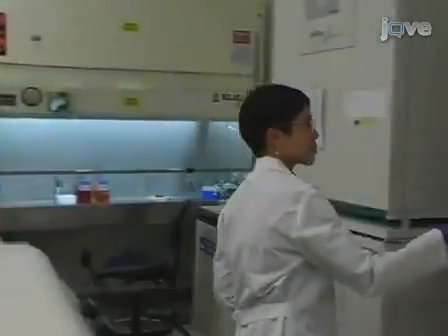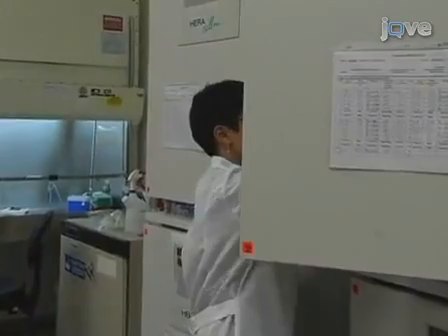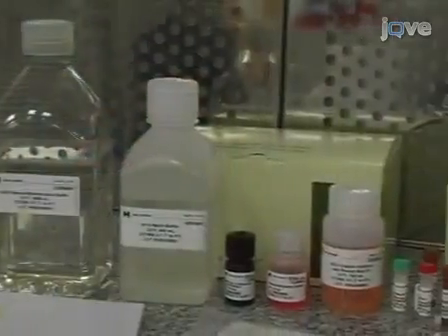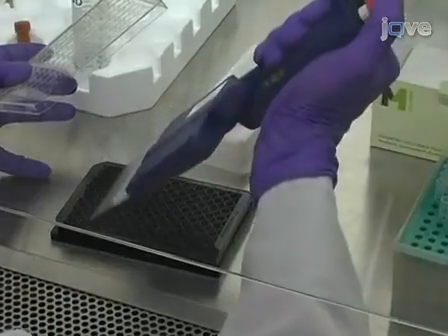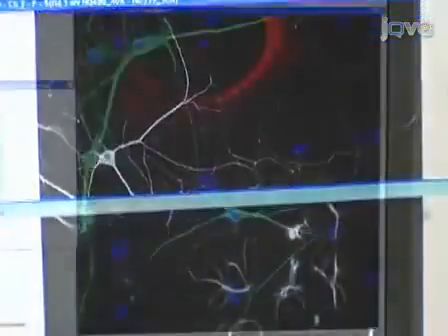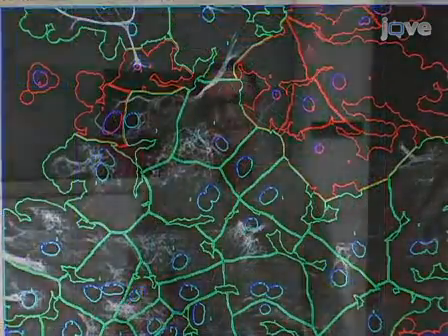Hi, I'm Andrew Ball, Senior Scientist at Millipore Corporation in Temecula, California. Today, Janet Anderl, Research Scientist for High Content Analysis, will demonstrate methods for high content screening of neurotoxicity using neuronal and astrocyte co-cultures. This technique employs reagents and protocols from the Neurotox-3 assay developed here at Millipore to screen for neurite outgrowth, neuronal and astrocyte development, and neuronal and astrocyte toxicity. I hope you enjoy the following sequences.